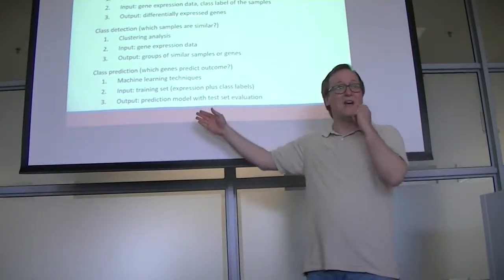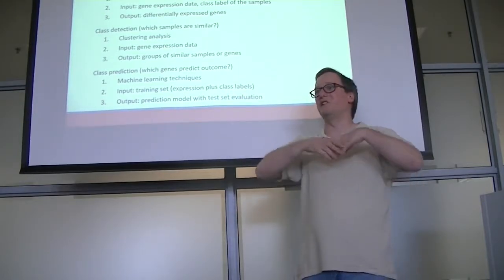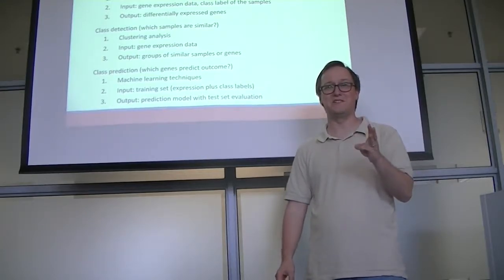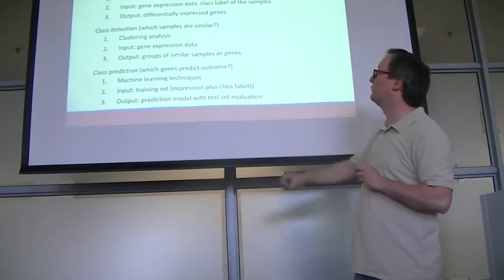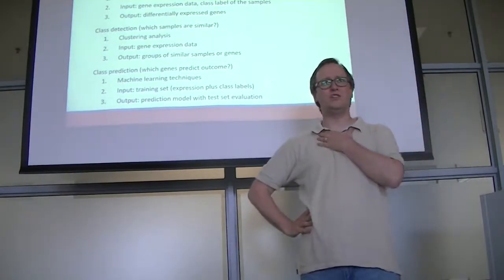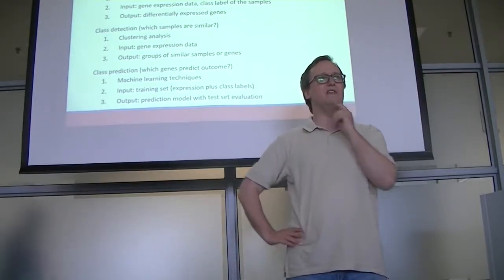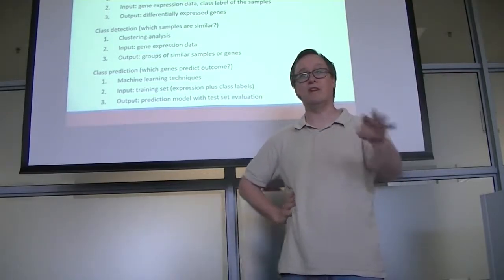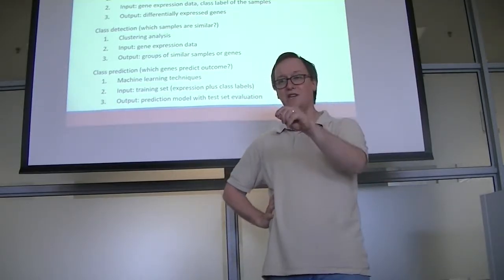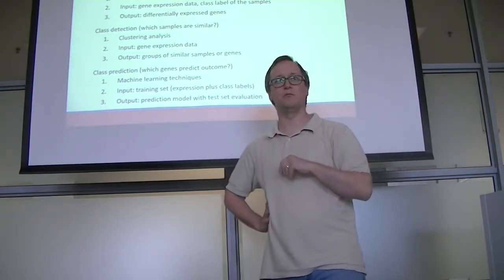But how do we go after stuff like this? What would machine learning be useful for? I'm going to try to walk you through 3 different applications of machine learning that would be very valuable for us. So first off, class comparison. What genes differentiate multiple cohorts? So let me say that I have a bunch of microarrays for folks who have cancer and a bunch of microarrays for folks who don't have cancer. And I want to know which genes are most differentiating between folks who do have cancer and folks who don't.